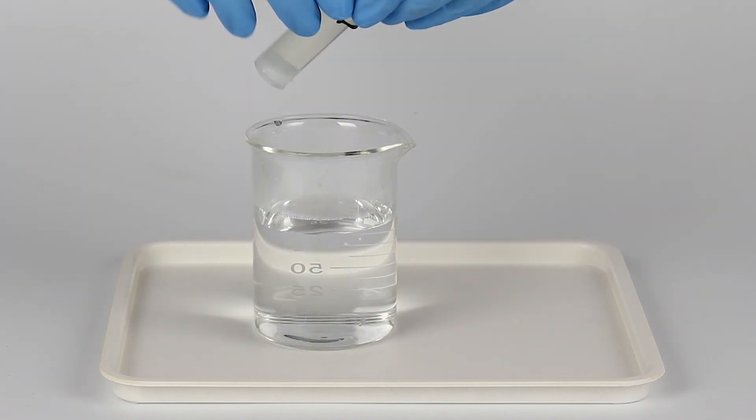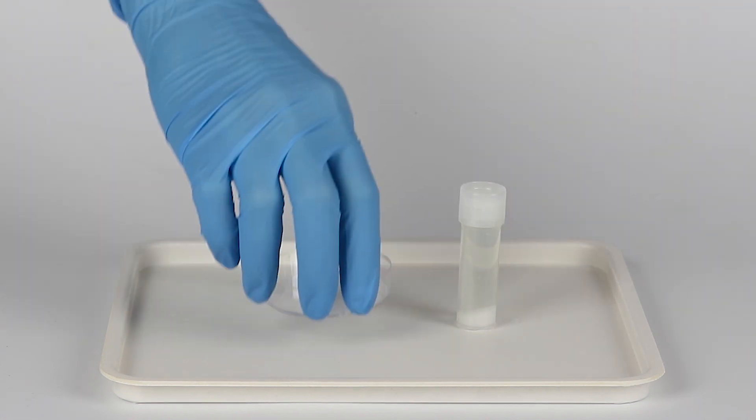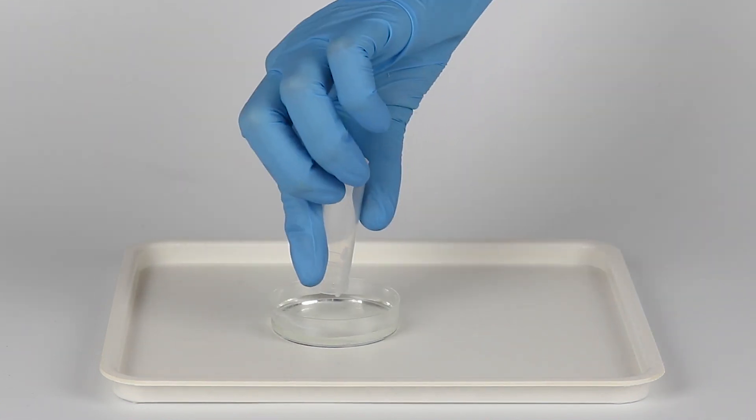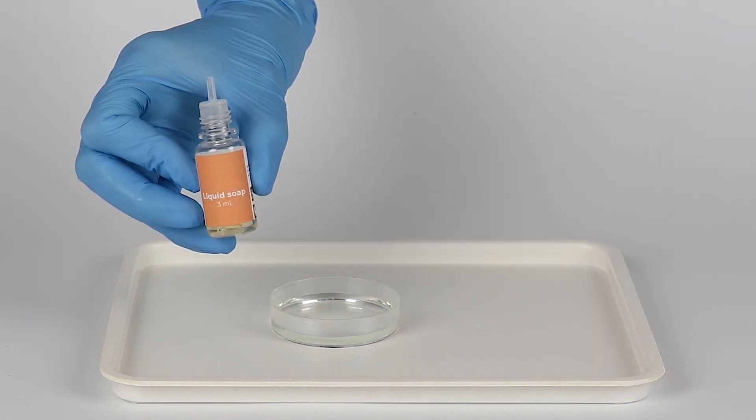Take the vial out of the beaker and remove the holder. Then pour the contents of the vial into the petri dish. Add one drop of liquid soap.